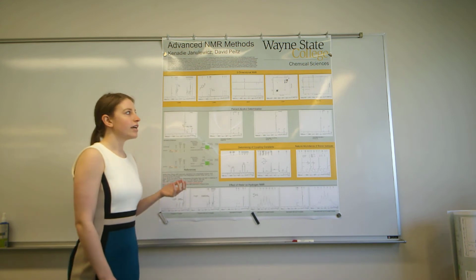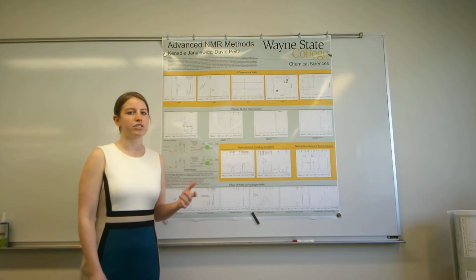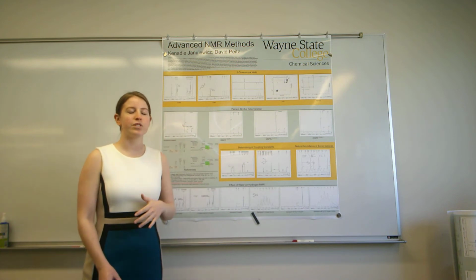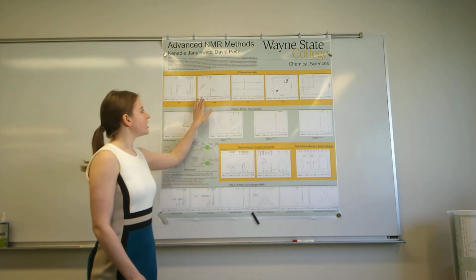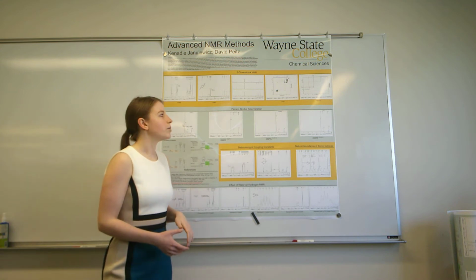The goal of these spectra is to identify which carbon peak corresponds to each carbon on our structures. When looking at the hydrogen NMR, we are able to determine the difference between A, B, and C, but when looking at the carbon, we are unable to. The only one we can differentiate is H. The rest we will have to look at different runs to tell apart.